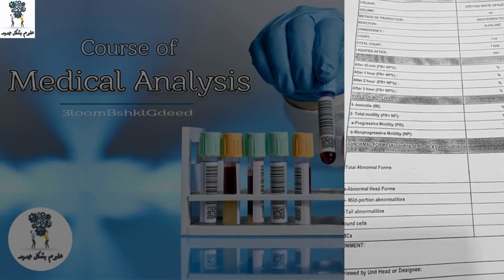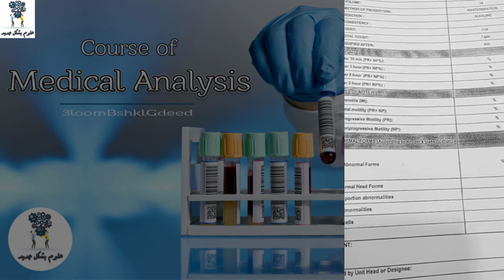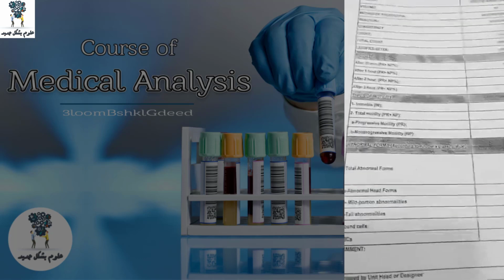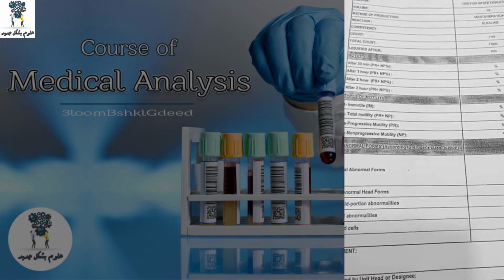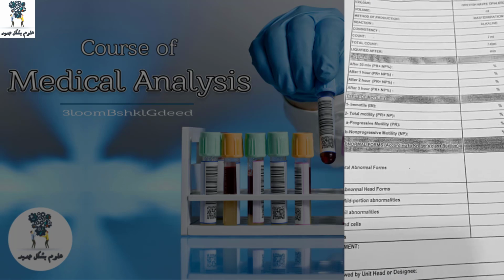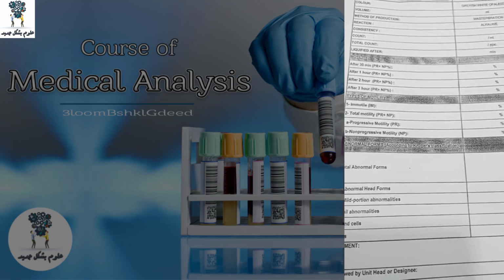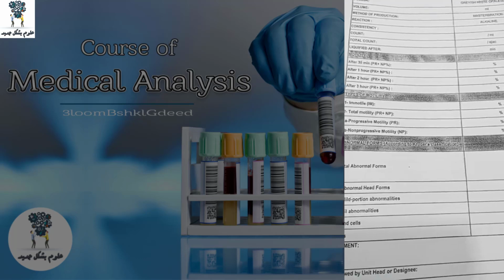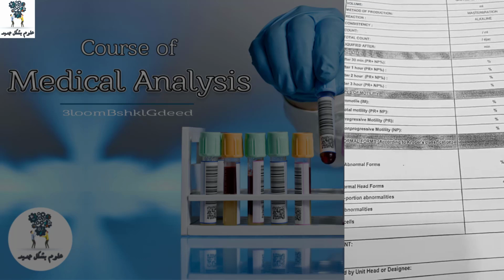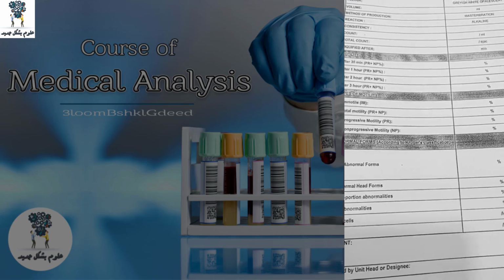قلنا لو اللون مثلا مختلف عن الجرينش وايت يبقى فعلا ده في مشكلة. بس أنا مش بقول يا جماعة ده مشكلة كذا، أنا مش بشخص، أنا بوصف. أنا ككيميائي أو دكتور في اللاب، بوصف العينة اللي قدامي. قلنا لو الحجم طبعا بتاع العينة قليل، أقل من 1.5، فبنسميها هايبوسبيرميا.